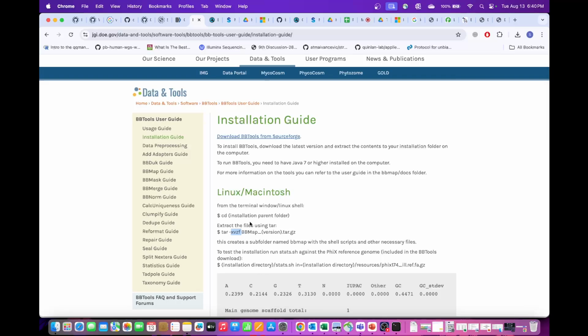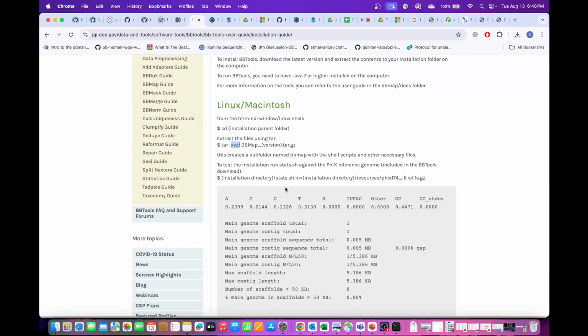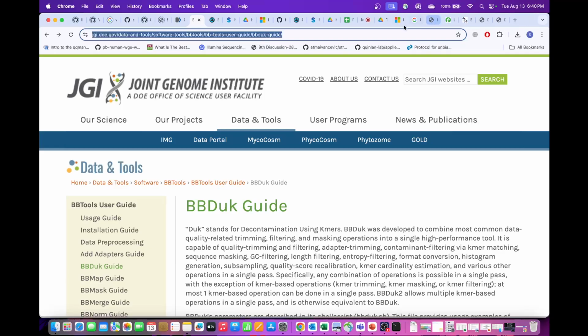See, someone was asking how do we do it for the tar file, do we have to do it separately. We do not. You give all the commands in one line. So you do not need to do separate unzipping. You give it all at once, it does that for you. Anyway, so basically this is the portal, and this is the guide. If you want to take a look, I'll send you.